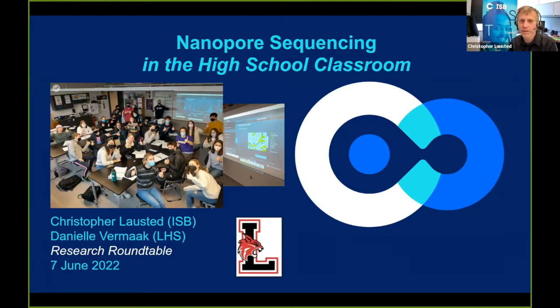We're going to tell you about a curriculum pilot project that we developed recently and then tested over the course of about a month at Lincoln High School in their new Genome Science elective class. I think it was quite successful, and so we're going to be working to share this curriculum and to try to put together kits to make it easier for other schools who might wish to use it.